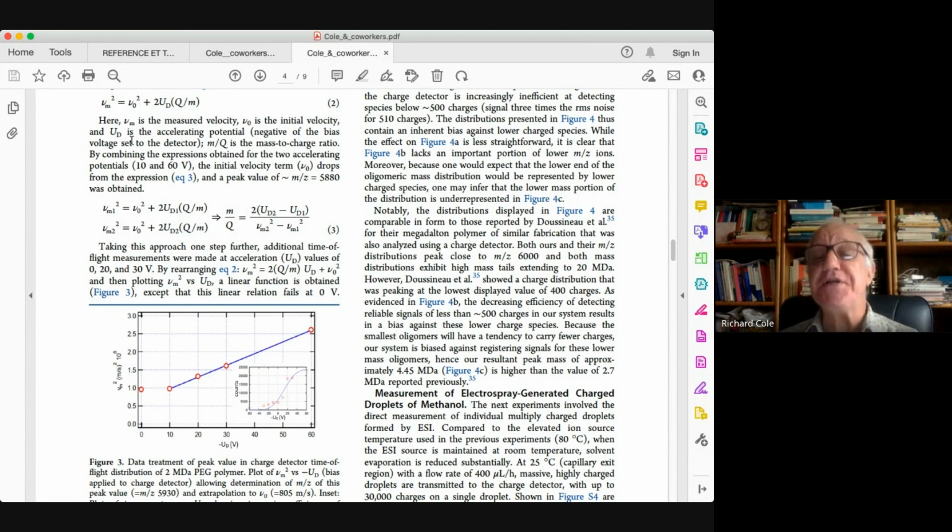Plus, we have a series of electrostatic lenses on the inside of the mass spectrometer. So it's actually quite complicated to know what that initial velocity is as your ions head into the mass spectrometer. And in addition, imagine you change some pumps because something breaks down. Then your pumping condition has changed slightly. That could have an effect on the initial velocity. So this is a real difficulty for us to evaluate accurately.